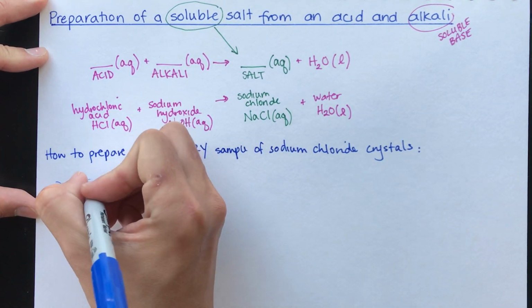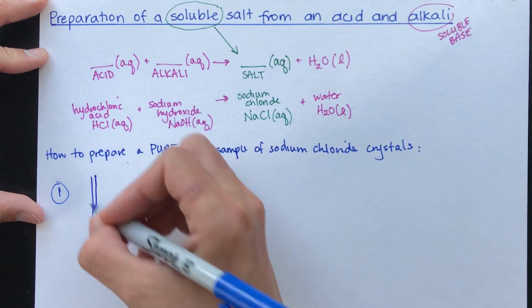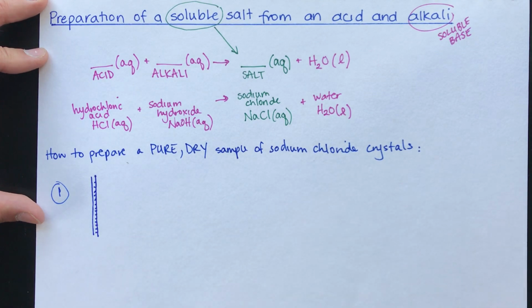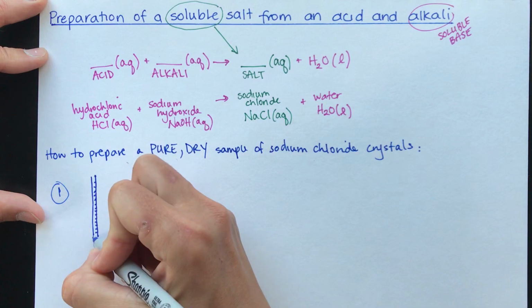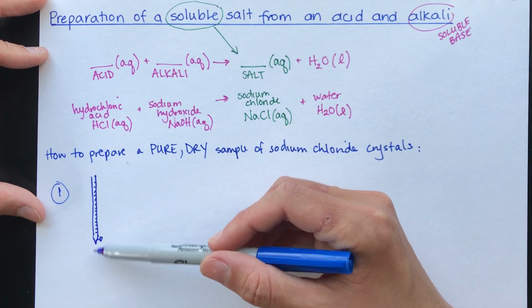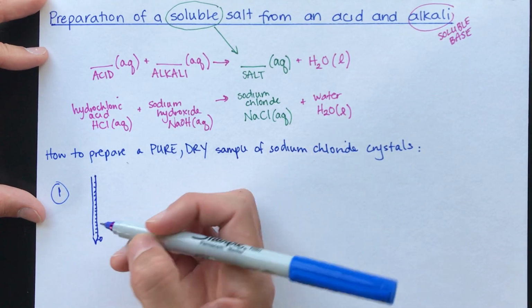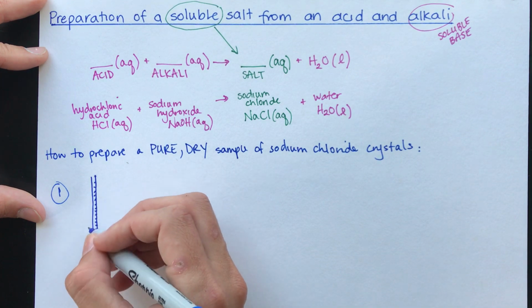And the piece of equipment you're going to use is called a burette. You'll see in the video after this one, when you watch someone actually do this experiment, what a burette looks like. But it's a tall, thin tube of glass with very accurate readings on the side. This is more accurate than a measuring cylinder. They usually go to about 0.05 of a centimeter cubed. So very accurate. It has a tap at the bottom. That's the other important aspect of a burette, so that you can control the flow of solution. And as you get close to where you want, you can even control it by turning the tap and it will come out drop by drop. So that's your equipment you're going to use. And we'll use that to add our base, or our alkali sodium hydroxide, to the acid.